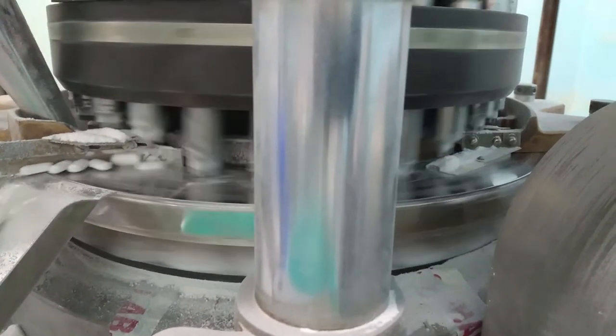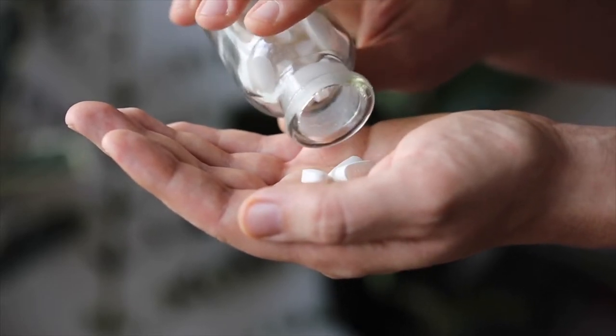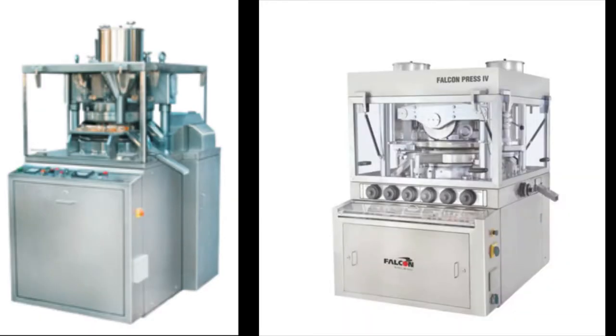Most students have seen single-punch manually operated compression machines in their laboratories. Here we will see an industrial version of it. Compression machines come in various types. The most common ones are the 27-station and the 45-station double rotary machines.